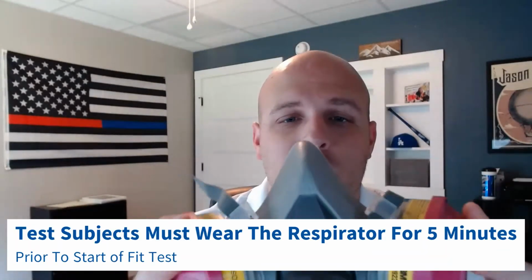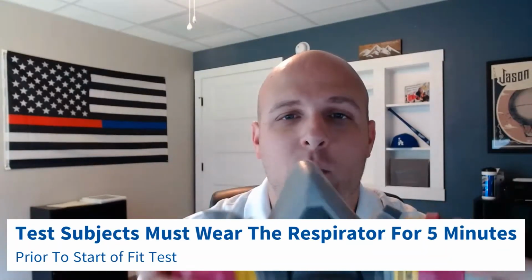And I'm going to point things out, again, that maybe some people are not aware of. Maybe you are, and that's great. But some things that I have seen customers, clients, and people in all types of industries look over and maybe misinterpret or misunderstand. But one of the first things you're going to do, once they figure out what type of respirator they want to use, is have them put that respirator on for 5 minutes prior to doing that fit test. And that is a requirement from the OSHA standard, to have them wear that respirator for 5 minutes prior to doing the fit test.